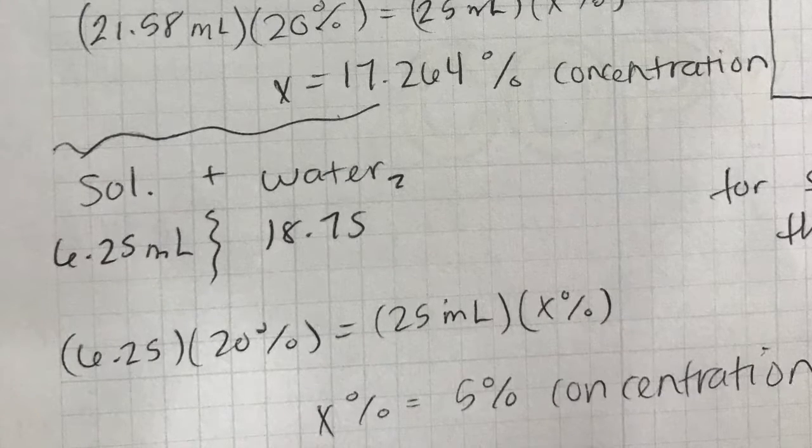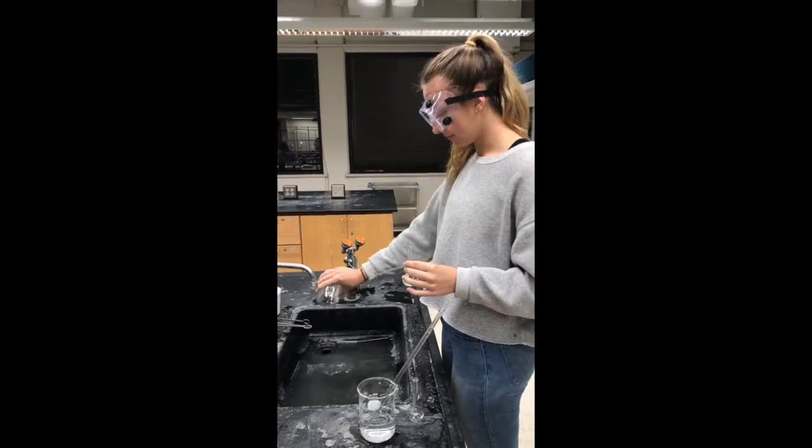That's our concentration percentage. Now we're properly disposing of excess liquids.